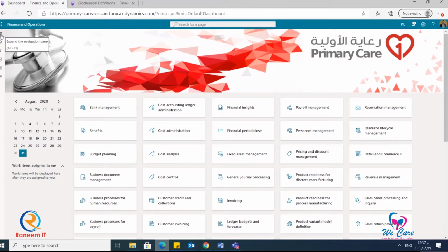visits for these patients, and requesting laboratory tests for them. Then we'll show you how these laboratory tests are reflected into laboratory screens. After that, we will show you how we can define and set up our laboratories, our equipments used to analyze samples within our laboratories, and how to define our laboratory tests.